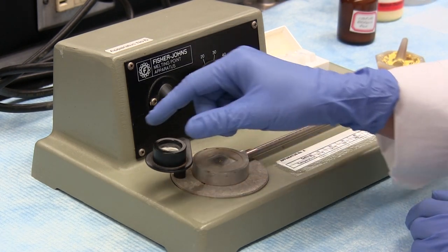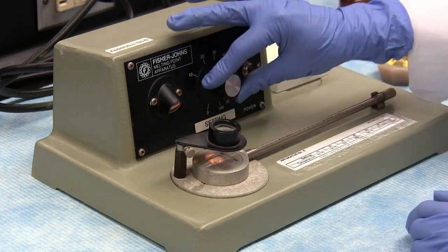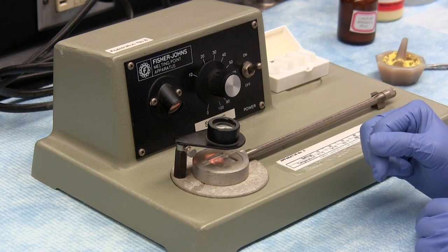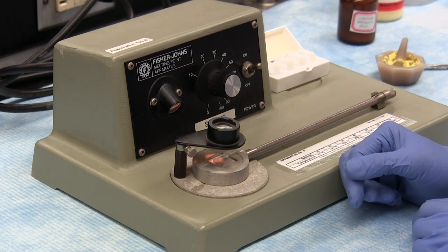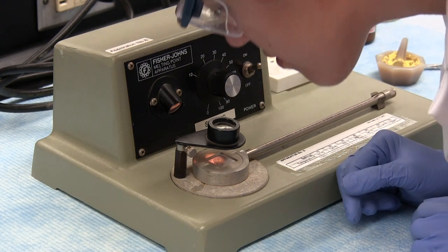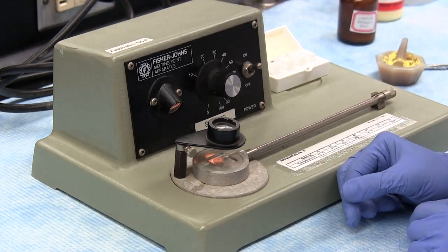establish an approximate melting point for the compound by first heating rapidly at the maximum setting of the temperature regulator, and then the stage is cooled to 20 to 30 degrees below this roughly determined melting point, and the procedure is repeated on fresh sample, this time adjusting the rate of heating with the temperature regulator to achieve a low rate, about 2 degrees per minute of heating as we approach and go through the solid's melting point.